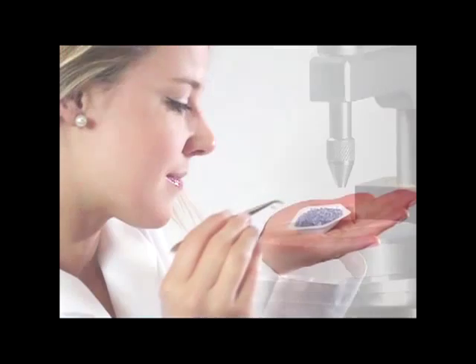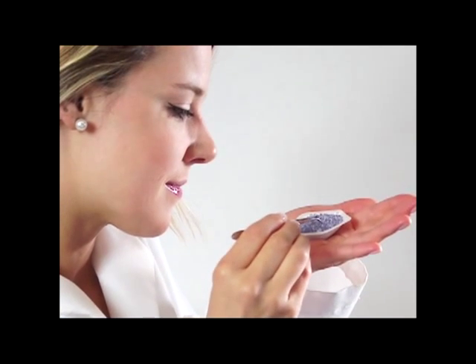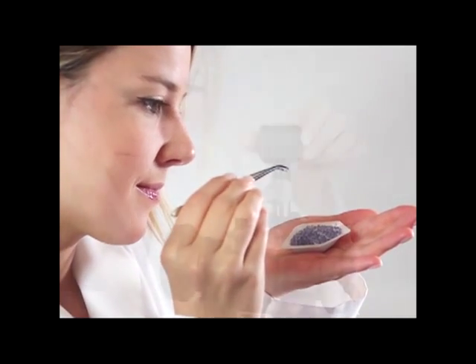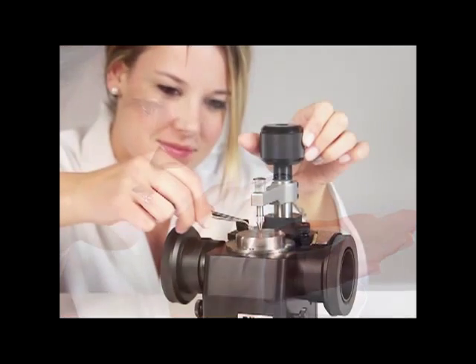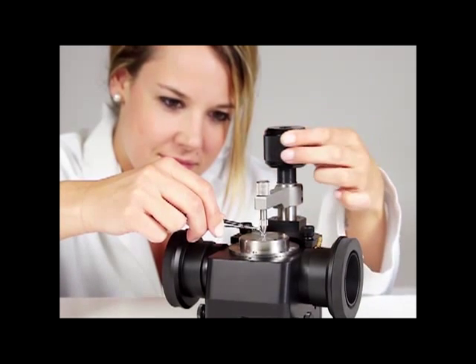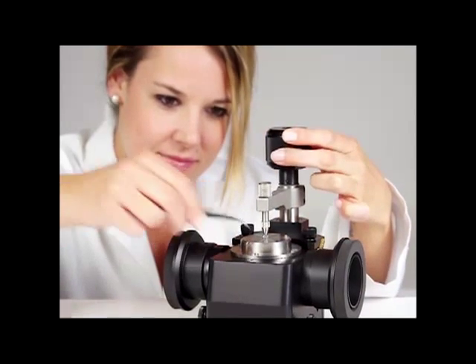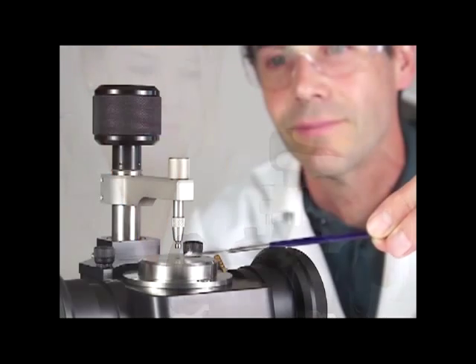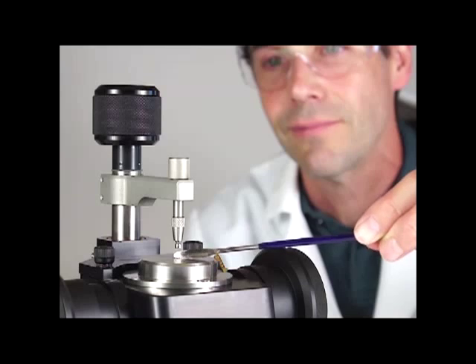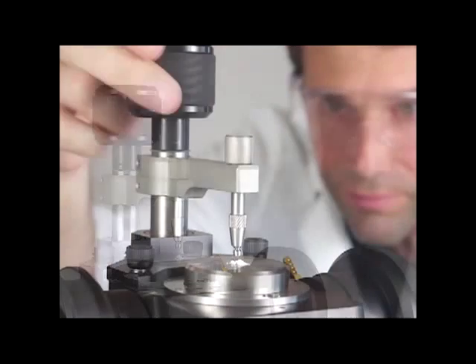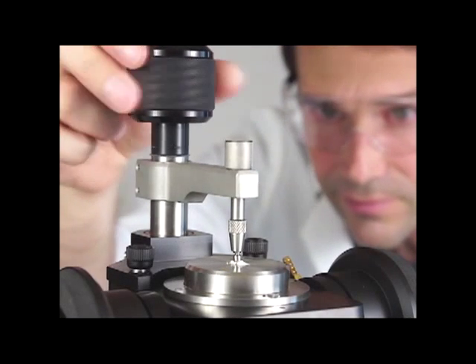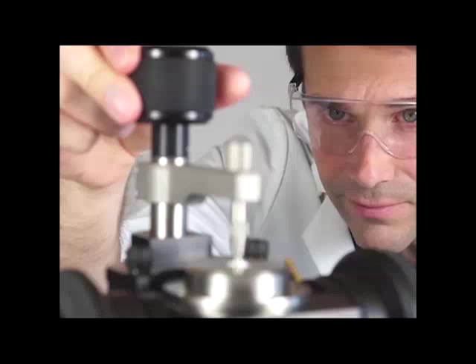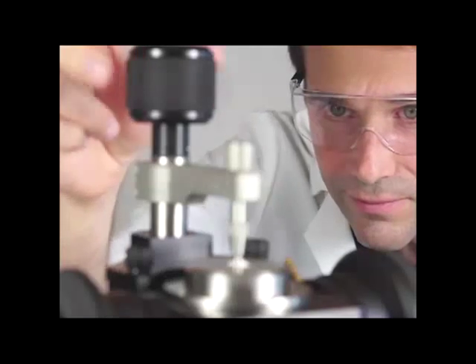Three distinctive tips for the high-pressure clamp accommodate various sample types. The concave tip, designed for polymer pellets, keeps the sample positioned over the crystal. The swivel tip for irregularly shaped or uneven samples, and the flat tip for fibers, rubber, and films.